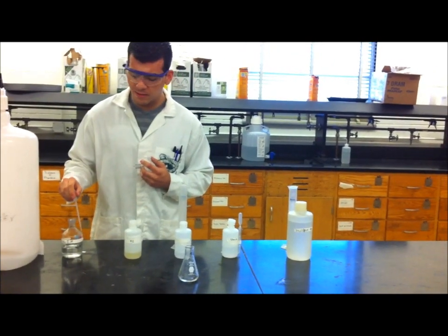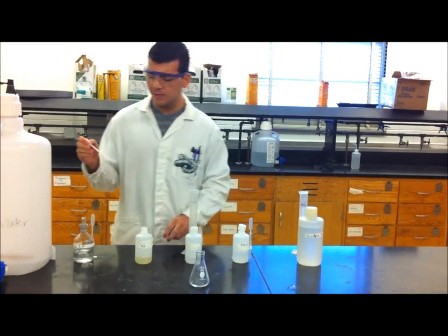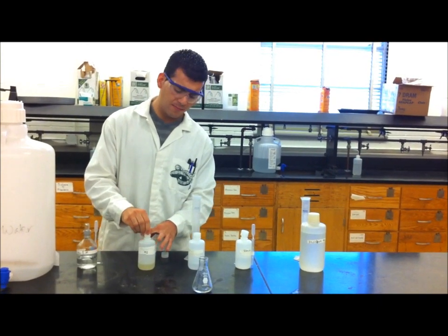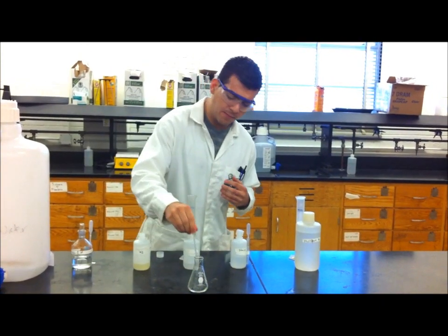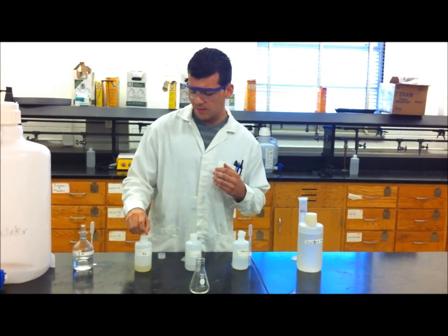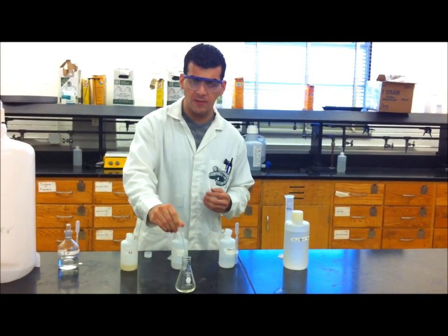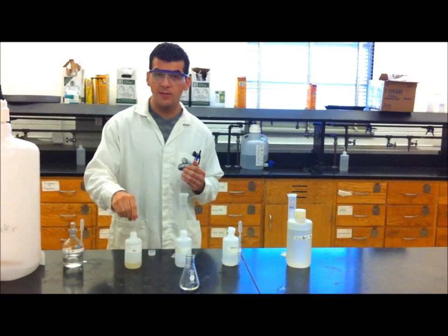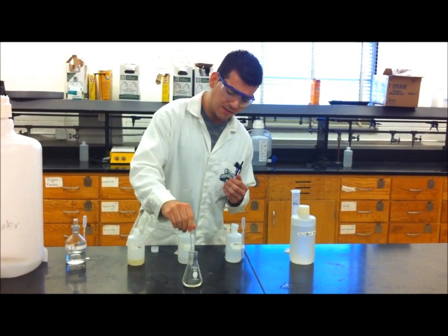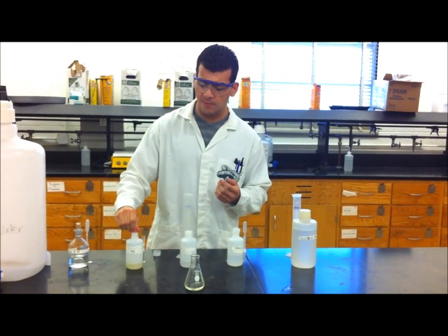Next you will need potassium iodide. You will use four milliliters of this to react with hydrogen peroxide to form iodine. The iodine will then react with the sodium thiosulfate to create tetrathionate, recycling the iodide ions until the sodium thiosulfate has been completely consumed by the reaction.